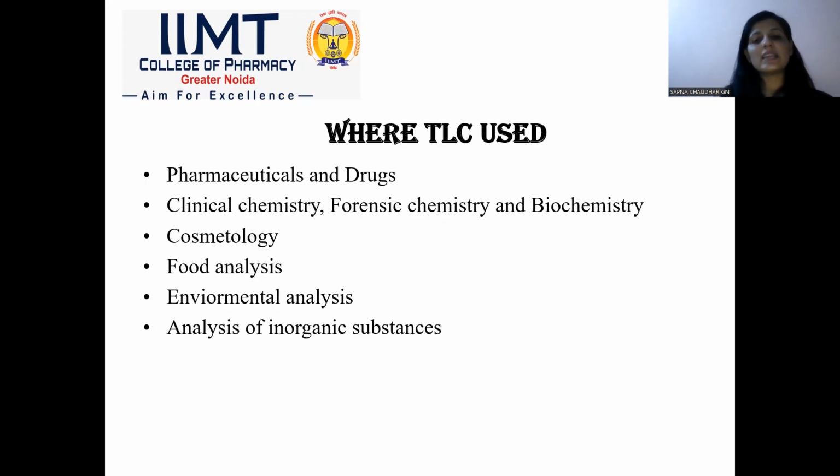This technique can be used in pharmaceuticals and drug testing; the separation of various pharmaceuticals and drugs takes place using the TLC technique. In clinical chemistry, biochemistry, and forensic chemistry, TLC is also used. Next is cosmetology, food analysis, environmental analysis, or the analysis of inorganic substances. TLC is used in various departments, and this technique is very famous for the separation of components.